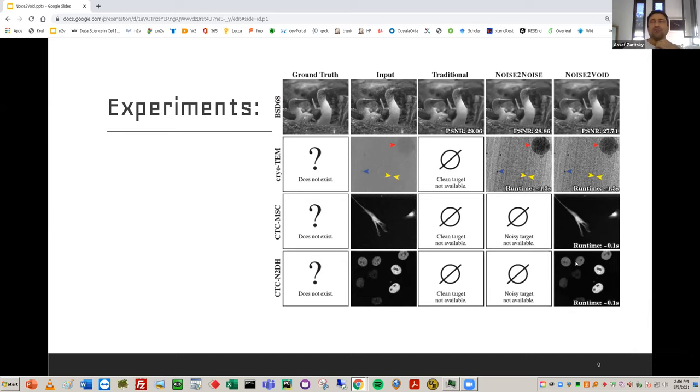In principle, you could think of ways to evaluate that. You have data sets that must have noisy images and ground truth. Or like you said, you can simulate the noise. Do you get the ground truth? What is the ground truth? If there are no data sets with pairs of ground truth and dirty images, how would you get the ground truth?